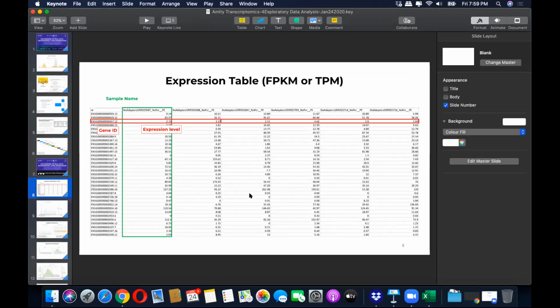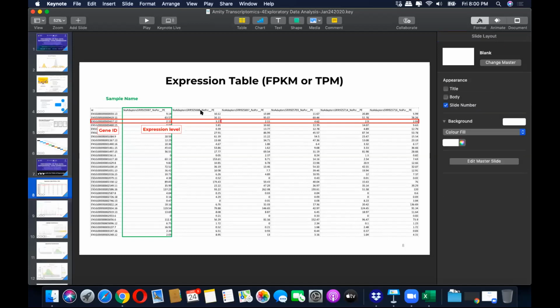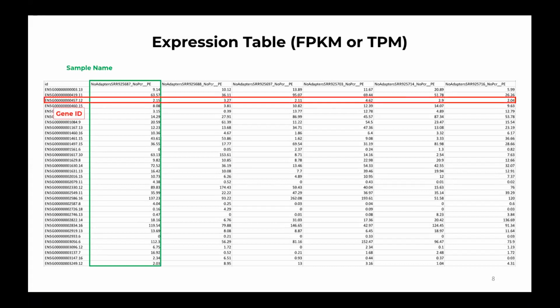What we have got out of it is this: when we started the analysis, we had a library of unstructured data, unrecognized reads in a text file, also called FASTA or FASTQ. The output from the pipeline is called structured data, where columns are sample names and rows are genes or isoforms in Ensembl format. Inside each cell, you will find quantified expression levels.